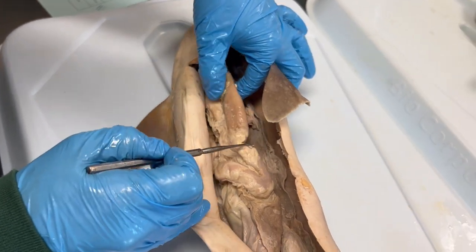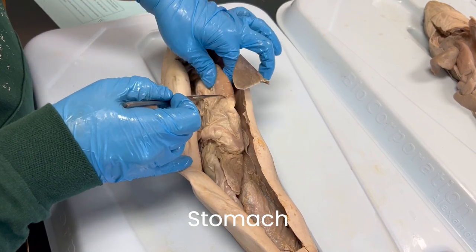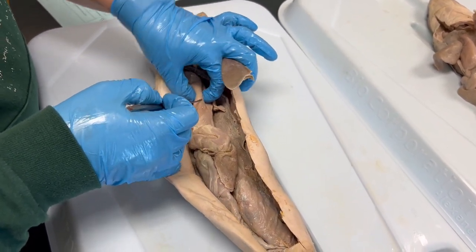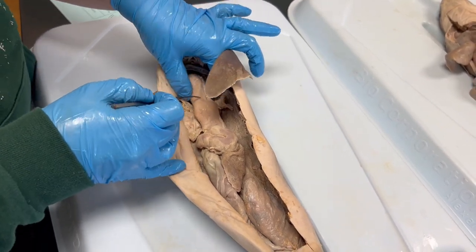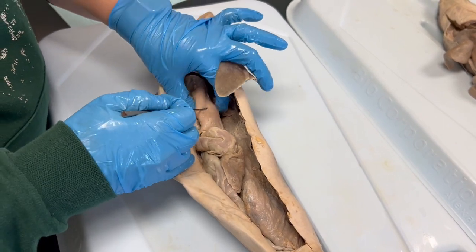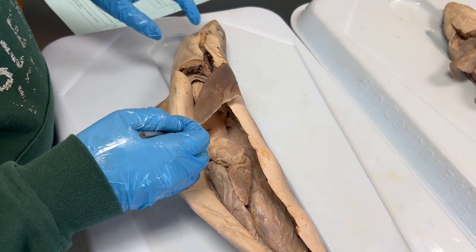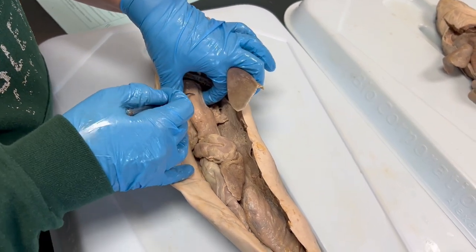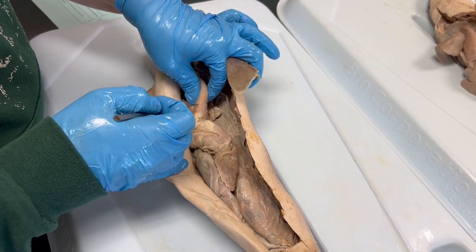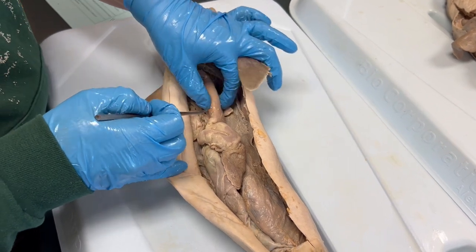The stomach of the shark is a very large J-shaped organ. A lot of mechanical digestion happens here. It has quite a bit of folded tissue inside called the rugae. Having these folds allows the stomach to expand to hold the prey that sharks tend to swallow whole. The stomach is a very muscular organ, which is useful as the shark requires it to grind up food as much as possible prior to it entering the intestinal portion of the digestive system.